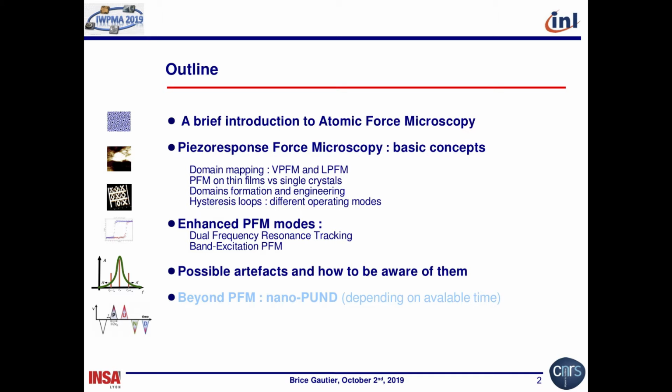And of course, what is very important is this section which is devoted to the artifacts, because since PFM is based on AFM, you will see that many artifacts are possible, and those artifacts can mimic the ferroelectric behavior of the sample. So you have to be aware of them to be able to interpret correctly the PFM data. And you will see that in certain cases, non-ferroelectric samples behave exactly like ferroelectric samples. And there are some clues that make you see the difference.